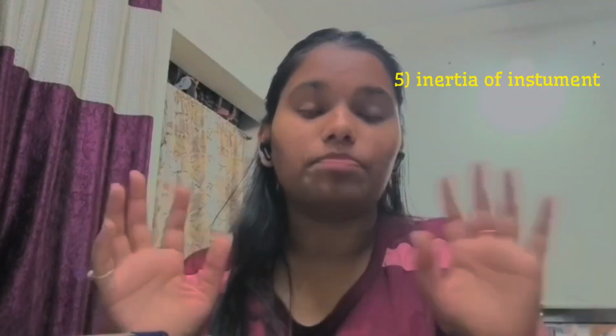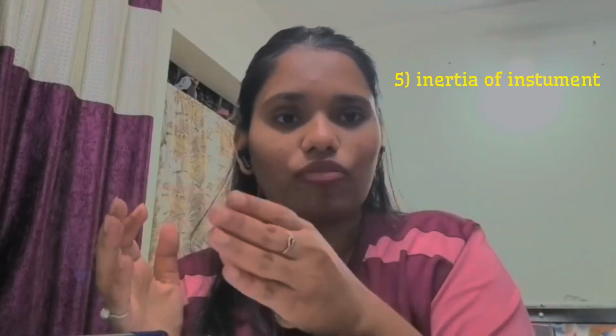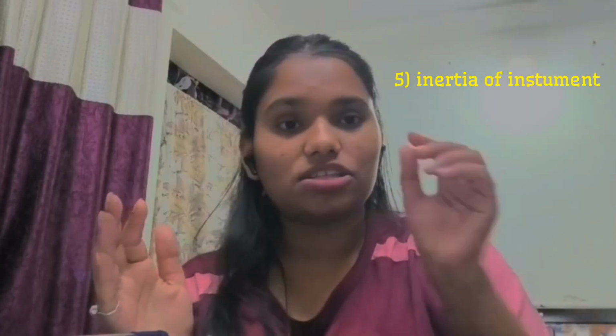Now everything is done: the nerve got the stimulus, it transmitted it, it reached the muscle, and the muscle contracted. But now this contraction has to be recorded. This recording is done by a mechanical instrument where we are using a thread or pen and then a recording drum. So the inertia of the instrument to record, the time taken in it, is also contributing to the total latent period caused in this muscle twitch.